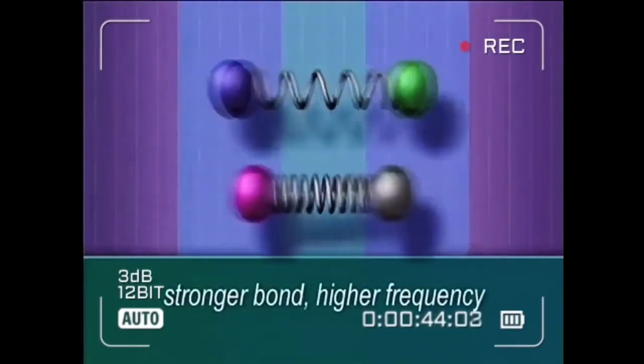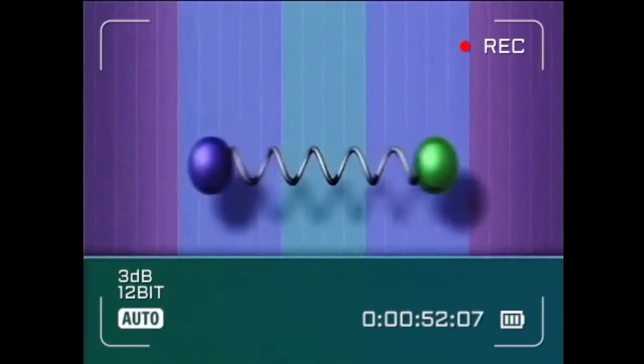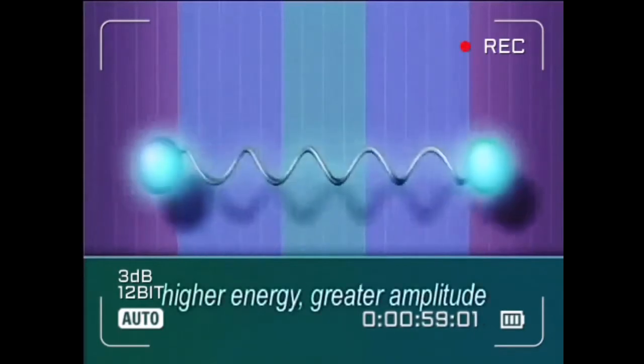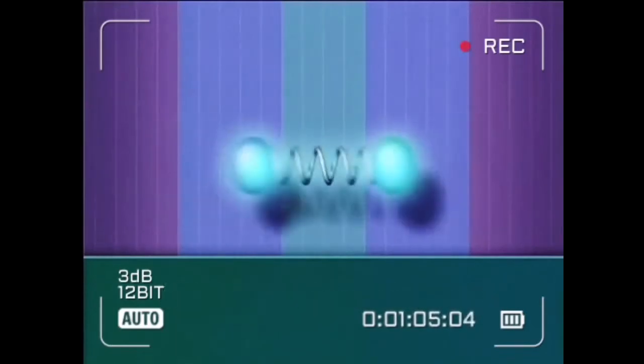At room temperature, most bonds will vibrate with the lowest possible amount of energy. But if radiation of the right frequency is applied, the bond can absorb energy and vibrate with greater amplitude. Most bonds absorb energy in the infrared region of the electromagnetic spectrum, which corresponds to heat.